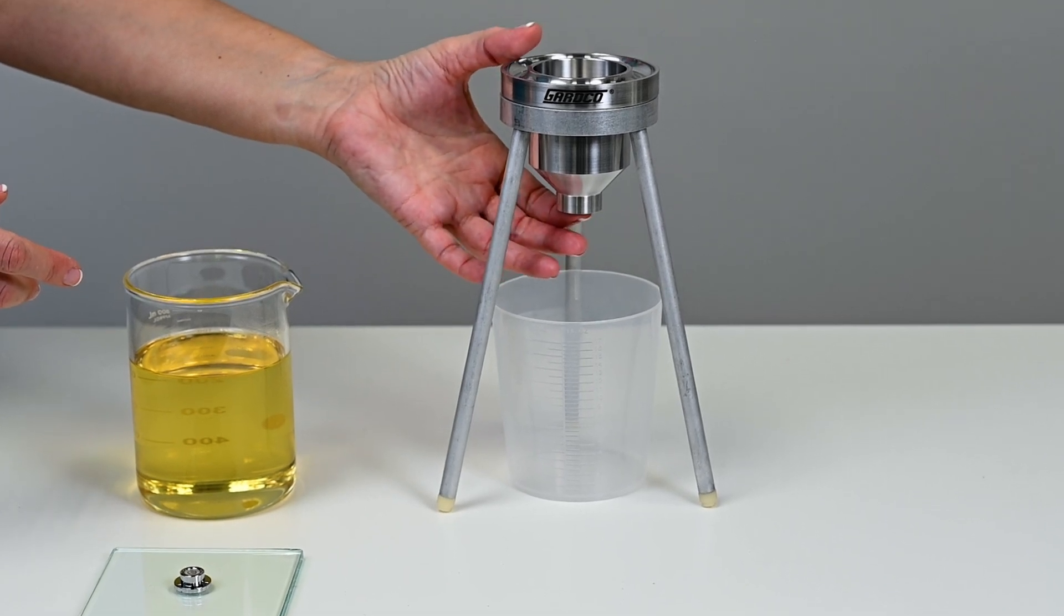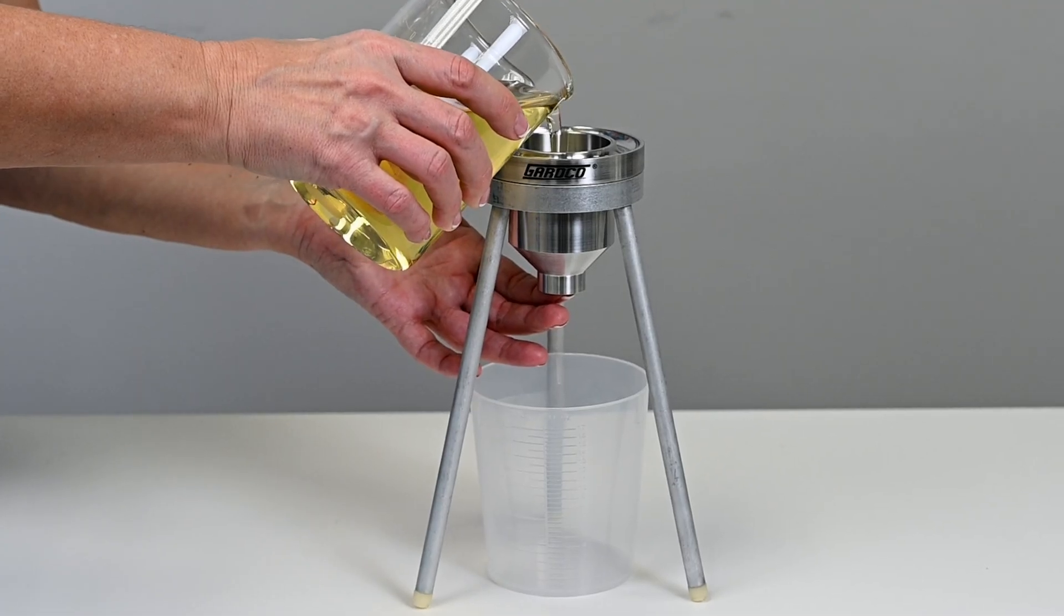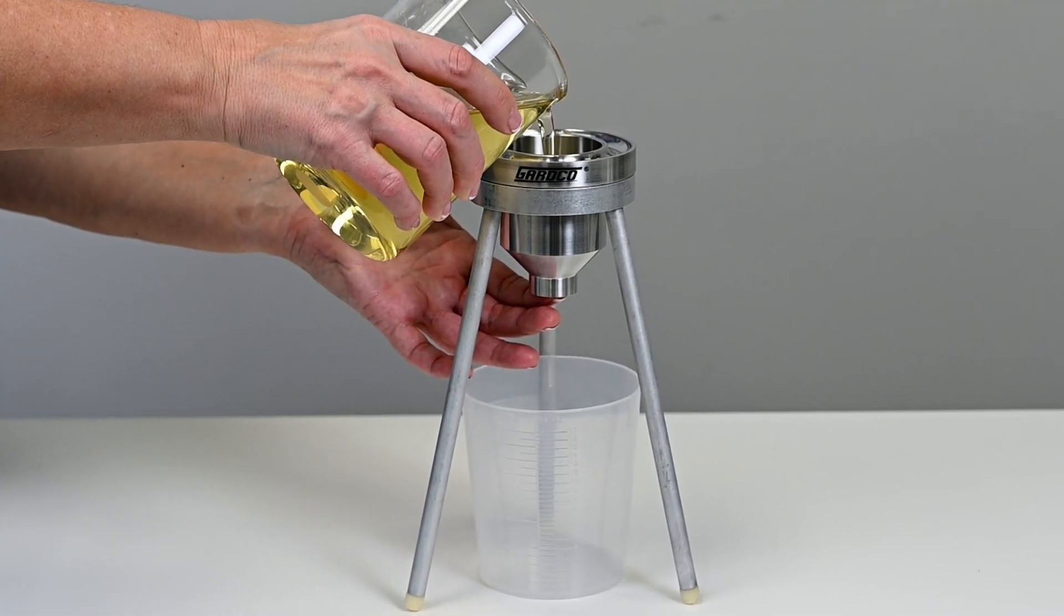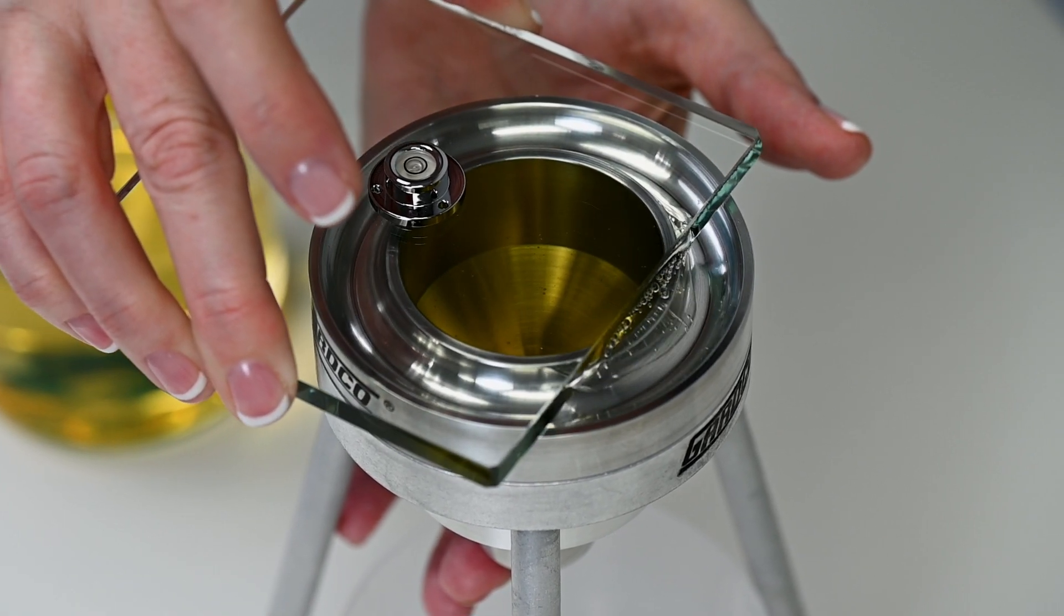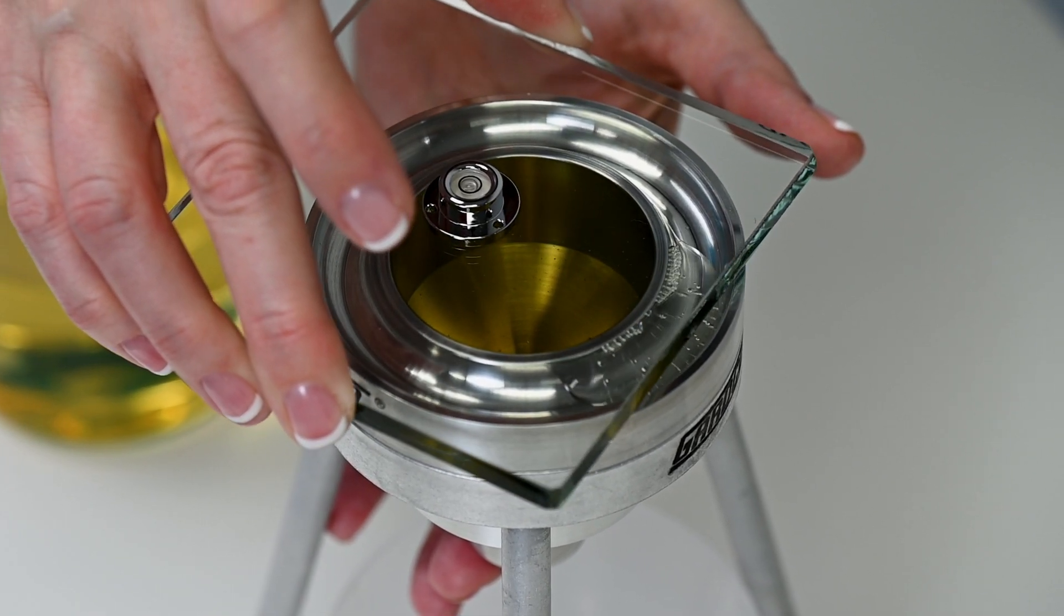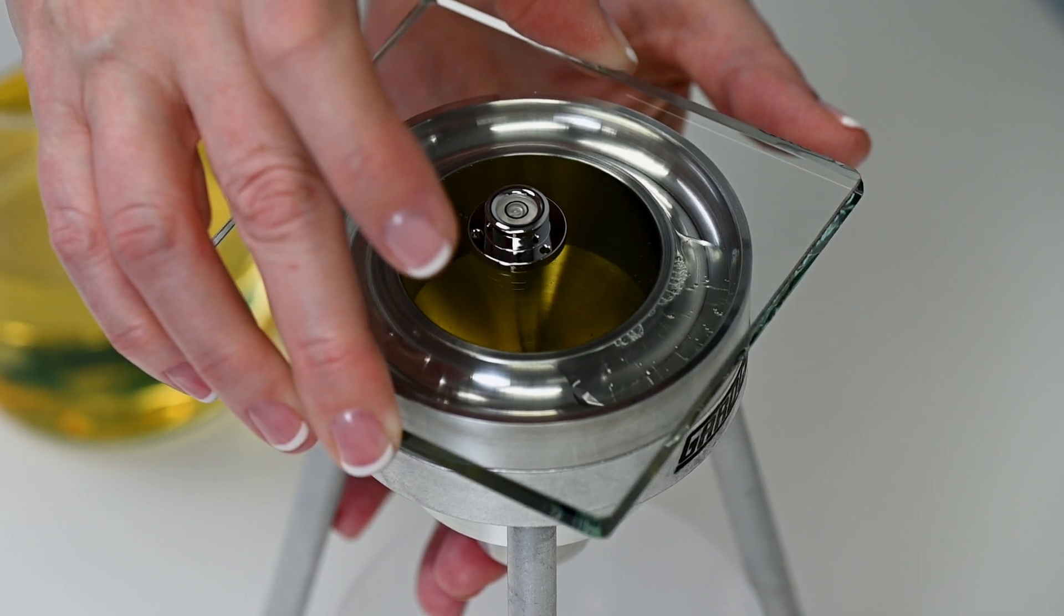Place a finger under the cup orifice and slightly overfill it with the test material. Slide the glass cover over the edge of the cup to scrape off any excess material and leave it on the top of the cup, creating a vacuum.